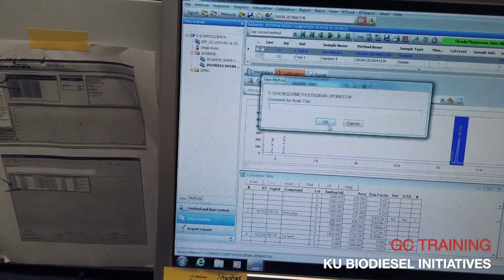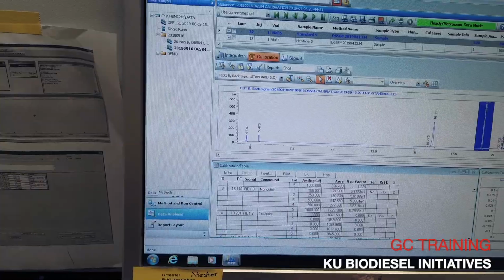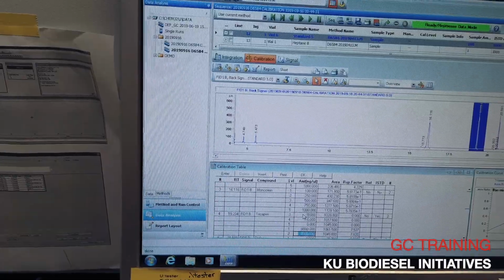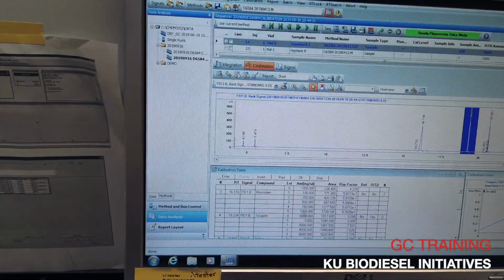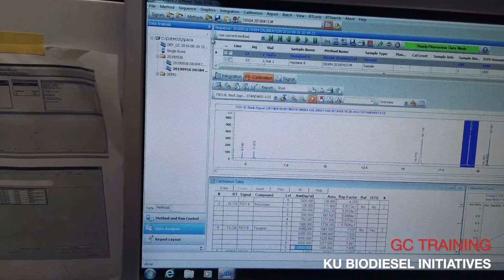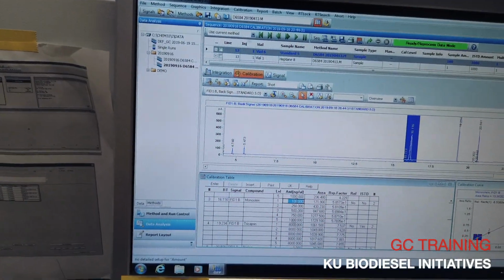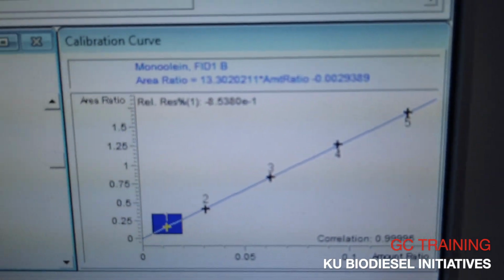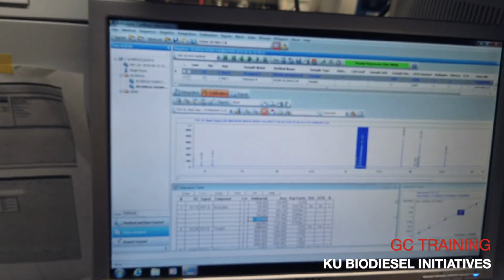Okay, so I'm just gonna keep saying. Oh, okay. So this is getting mad at me right now because I haven't updated the internal standard. Since it references the internal standard, it won't actually work until it goes through. What happens if you press enter? Same thing. Okay, so let's try that. Oh, that one looks pretty linear. That one's got 4 9s. So that's pretty good. That's mono. Hooray! Got it. That one works.